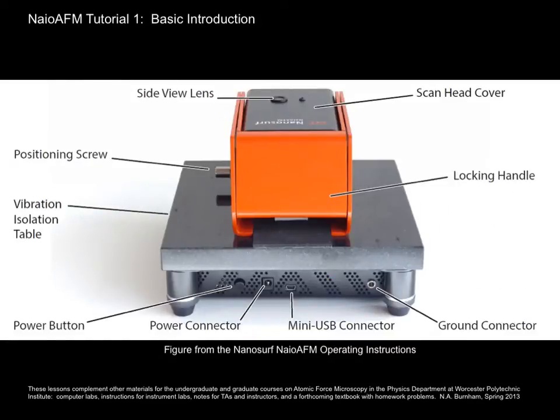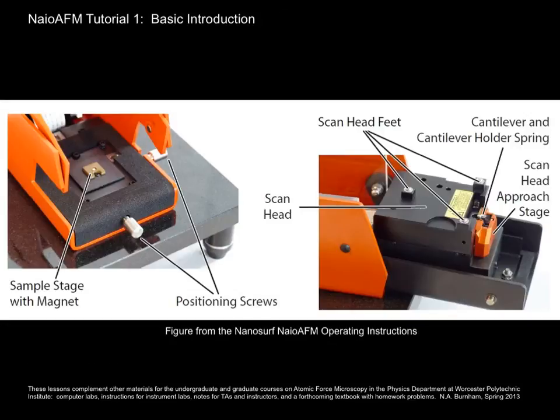Here's the back side. The parts that you'll be using are the power button and the locking handle. When you undo the locking handle, you'll see where the sample goes, and you'll see the scanner and the scan head. I'll show you the function of the scan head in the next slide.